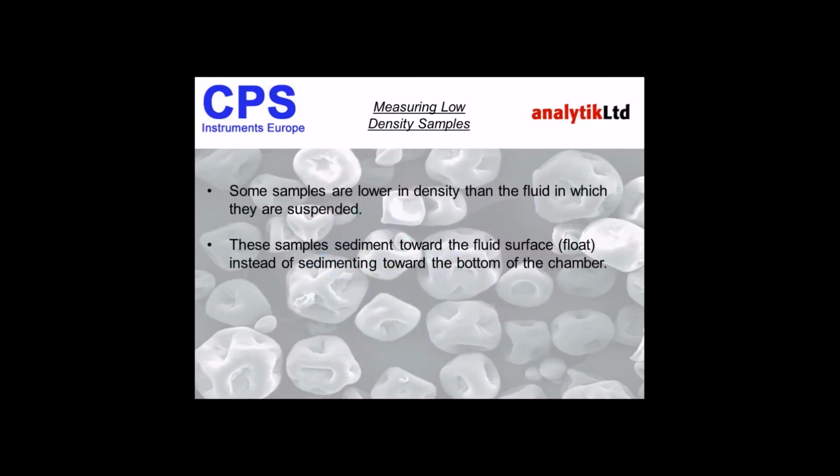Another requirement is where you may need to measure particles where the density is lower than the medium in which they are dispersed. So, for example, let's say you are looking at oil dispersion droplets in water. If you're trying to do this with a standard disk, as you can see, these particles will simply float on the surface. Now, wouldn't it be great if somehow you could inject that sample to the bottom of our chamber, or if you're looking at a disk, if you can inject it at the edge of the disk, so that rather than sedimenting, these particles will float from the outer edge of the disk to the center of the disk.